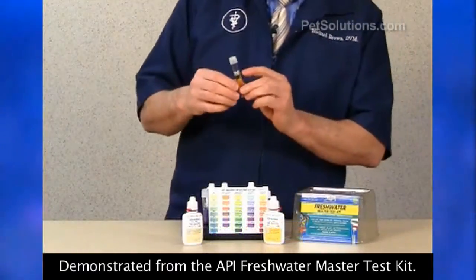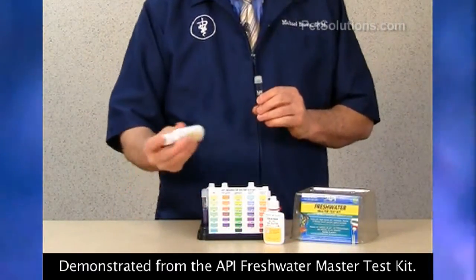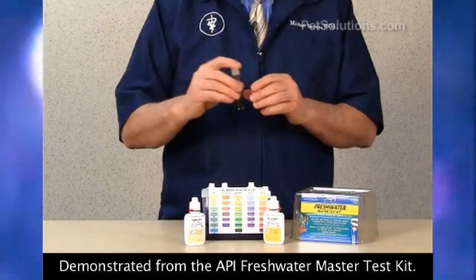To test, fill the test tube to the line — approximately 5 mLs. Shake the bottle before using. For test solution number one, add eight drops. Cap it, invert it.